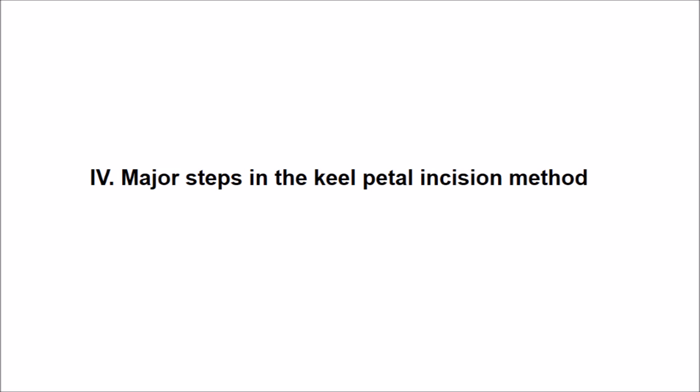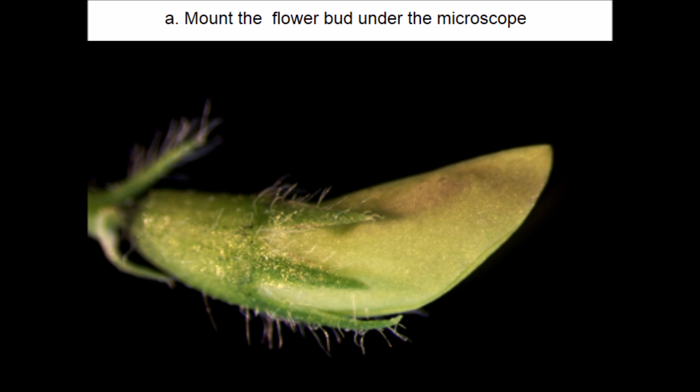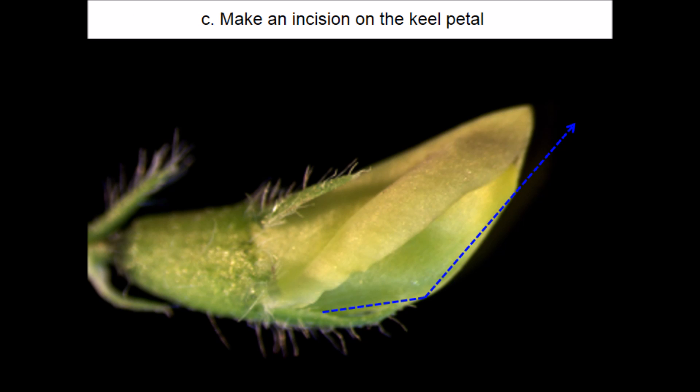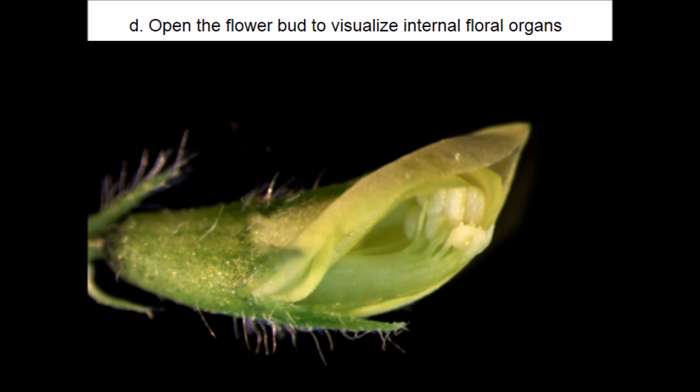Before I start showing the genetic crossing using the keel petal incision method, let me outline the major steps. First, select an optimal unopened flower bud as a female and mount it on the dissecting microscope stage. Then push the standard petal upwards using fine forceps from the opening side of the standard petal to visualize the underlying keel petal. Make an incision on the keel petal from the bottom one-third of the flower bud along the central line to dissect the flower bud. Then push the incised keel petal upwards to see the internal floral organs — stigma and anthers.